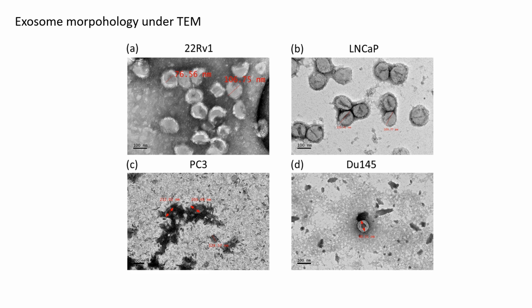This is how exosomes derived from prostate cancer cell lines look like under TEM. They appear either single or gathered, cup-shaped, rounded to oval frame particles. Some appeared shrunken and collapsed, with a mouth-like figure, having a slit or fissure in the middle of the vesicle. The end-to-end measurement of the particles ranges from 70 to 200 nanometer, which is within the predicted size of exosomes.